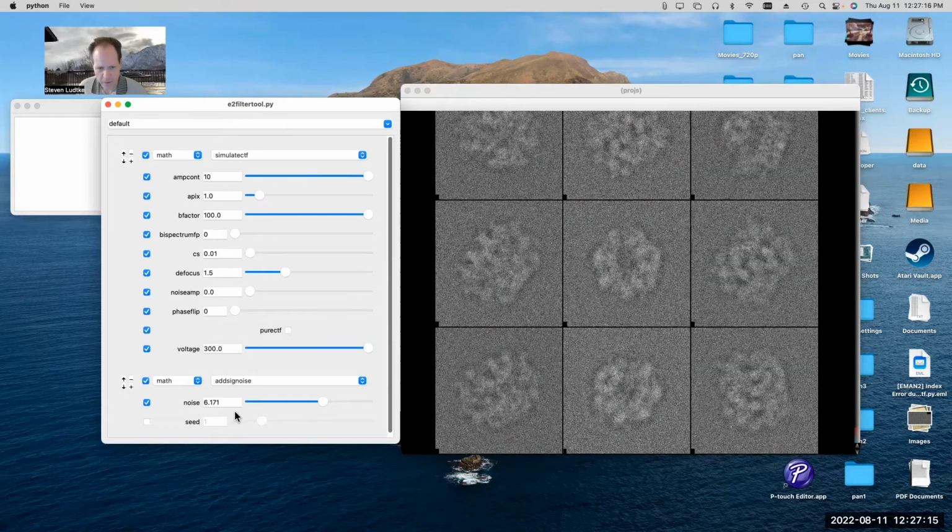It's not always necessarily going to be 5 or 6. You want to test it against your data, because it depends on the amplitudes that are present in the data itself. If I had simulated the data and made it have twice as strong amplitude, then I would also, well, this is in terms of standard deviations, so the absolute amplitude shouldn't matter, but the way I'm filtering the data might matter. Anyway, this value does require a little bit of testing. You don't want to just assume that it's okay.